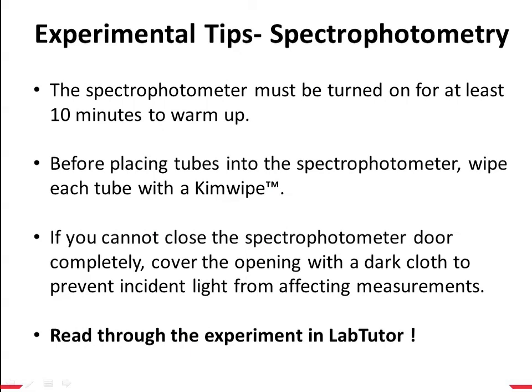So these are a few other experimental tips to keep in mind. The spectrophotometer must be turned on for at least 10 minutes to warm up. So as soon as you come into the lab, and especially if you're in the first lab group of the morning, the absolute first thing that you should do is to make sure that the spec is turned on. Before you place any tube into the spectrophotometer, be sure to wipe the tube down with a Kim wipe. Any fingerprints or smudges on the tubes are going to interfere with your readings. If you can't close the spectrophotometer door completely, be sure to cover the opening with a dark cloth, and that prevents incident light from affecting your measurements.